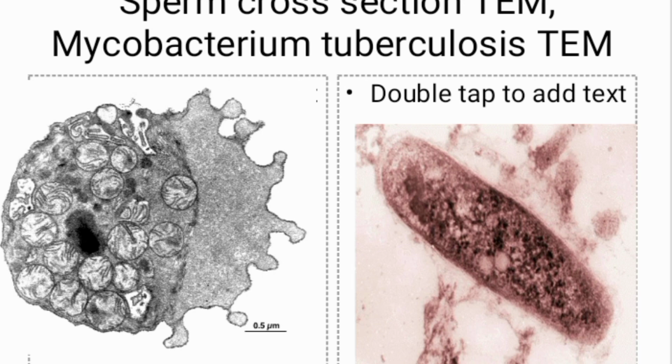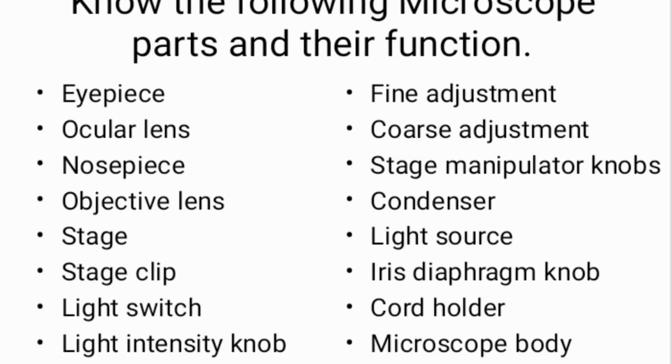So please, in your test and exam, this part is very important. Please take note. Know the following microscope parts and their functions. Please note, very important. But I'm going to run through them one after the other. So I've made a separate slide for these microscope parts and functions.